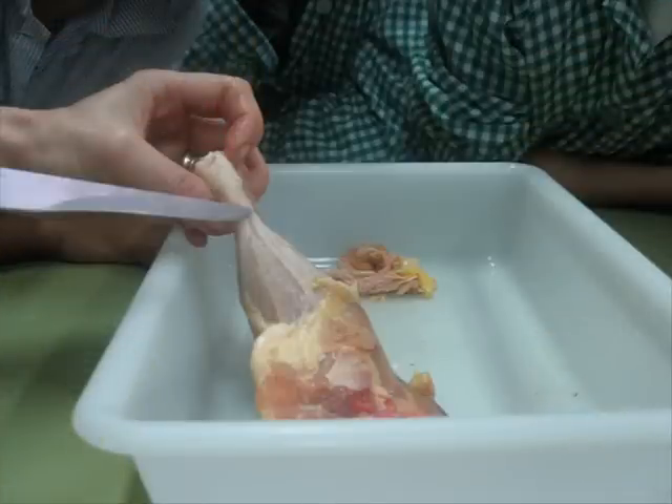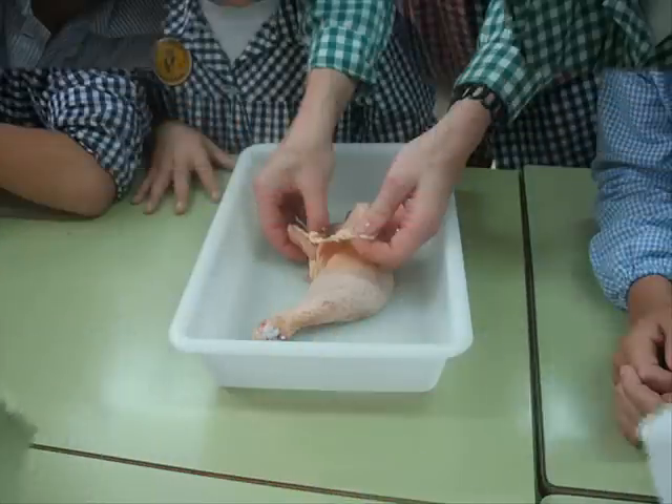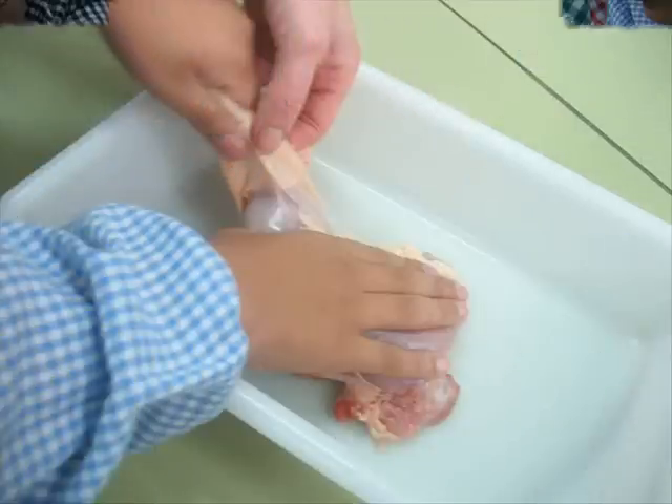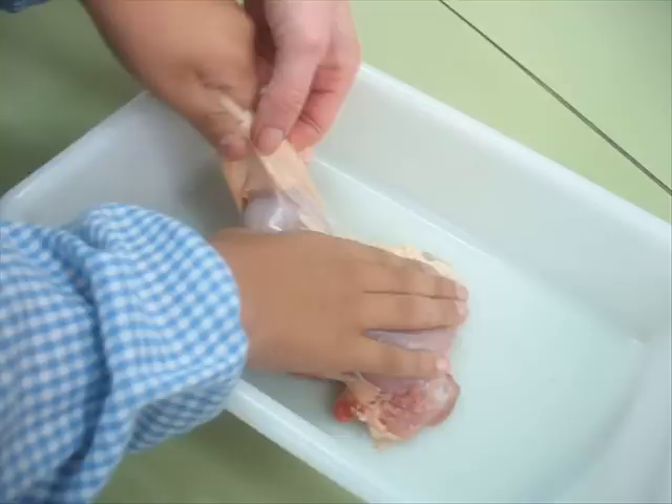Touch the skin and take it out slowly. Now you can see the bones, the joints, the muscles, the meat, the tendons, the cartilage and the veins.